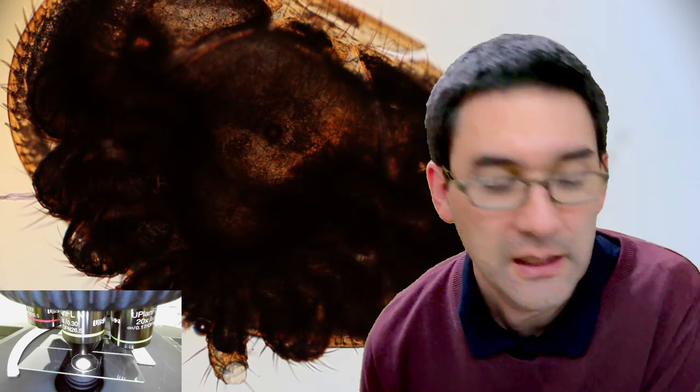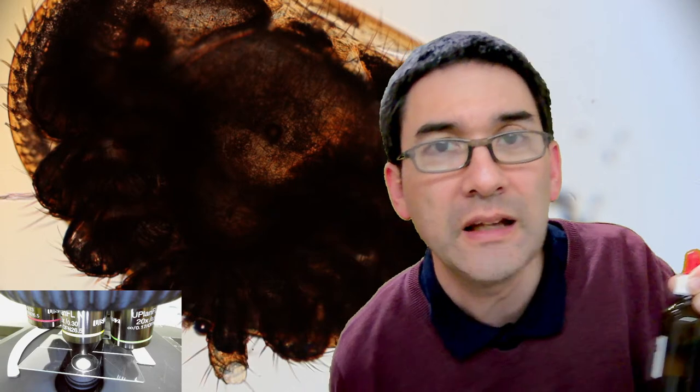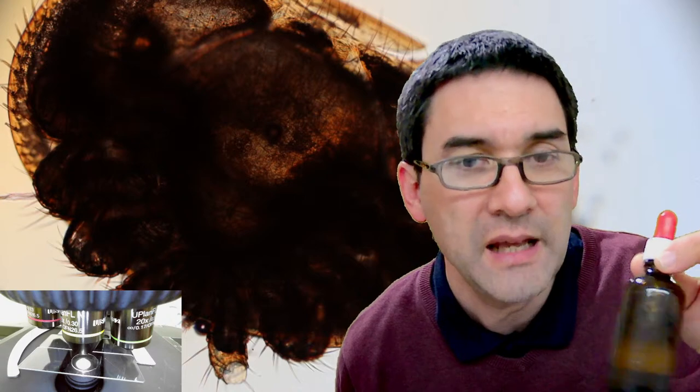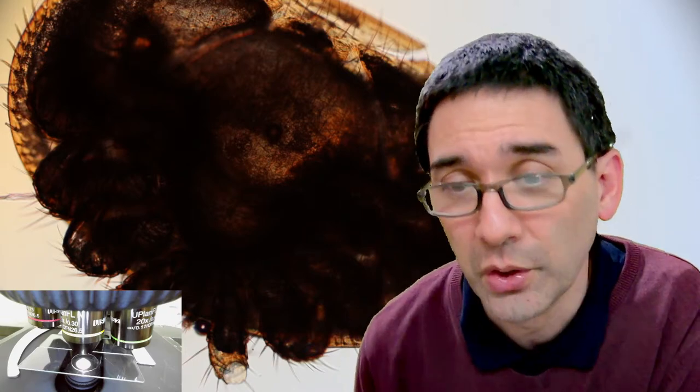Can polyvinyl alcohol, PVA, be used as a mounting medium as opposed to polyvinyl acetate? If I remember correctly, both seem to be possible. I've read it somewhere, and apparently sometimes it's even a mix of both polyvinyl alcohol and polyvinyl acetate. The recipe is apparently a little bit secret, but I heard there is a mixture of PVA, polyvinyl alcohol, and acetate in there. So I think it should work.